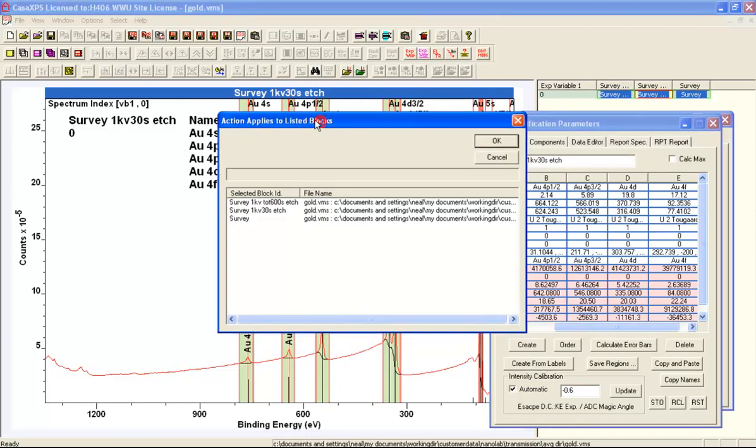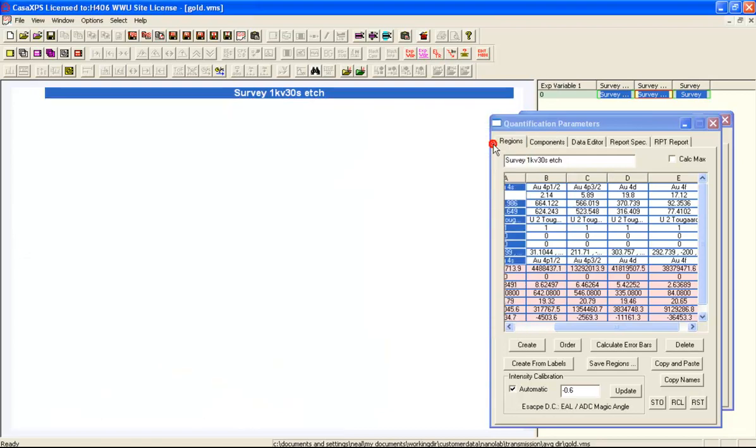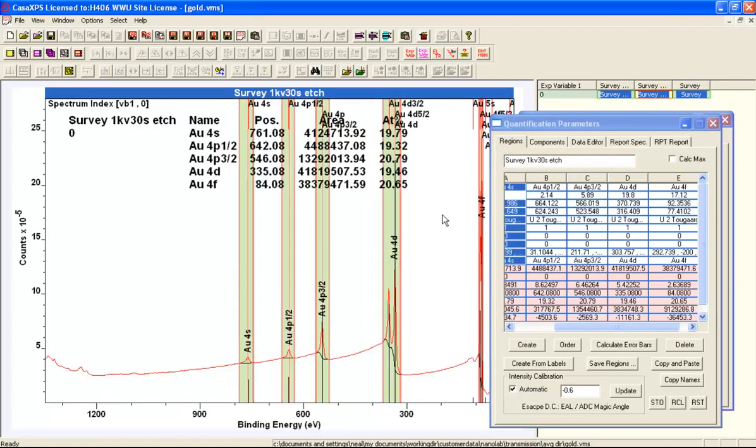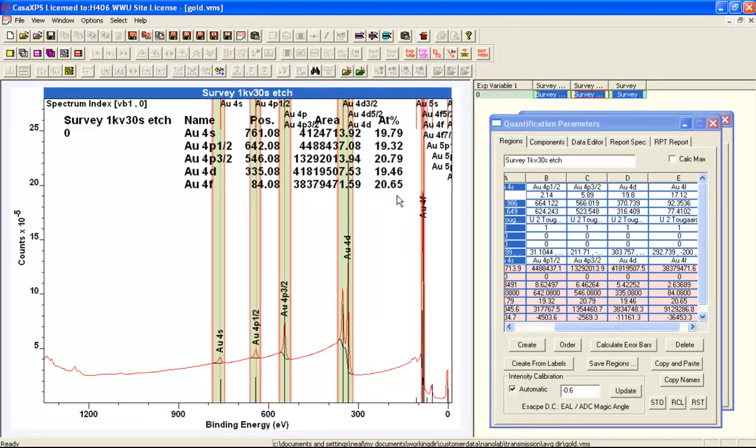Because this will apply to multiple files, it's going to give me a window that indicates I've got these files active and these VAMAS blocks active. So it's just the three that I see here. Now you can see that the escape depth correction is effective attenuation length, and I'm ending up with a quantification which is much closer to the expected 20% for each one of these.